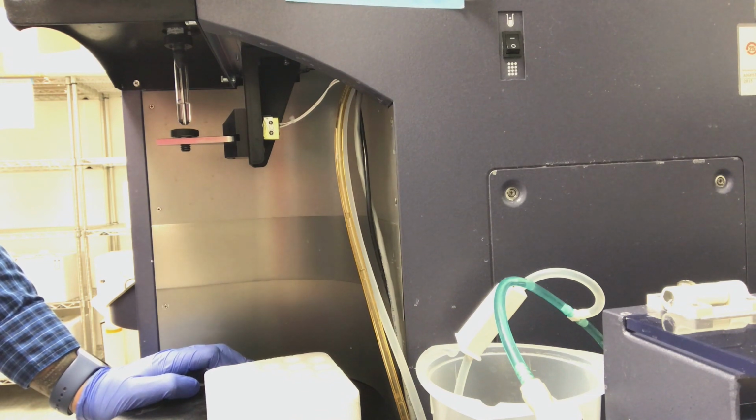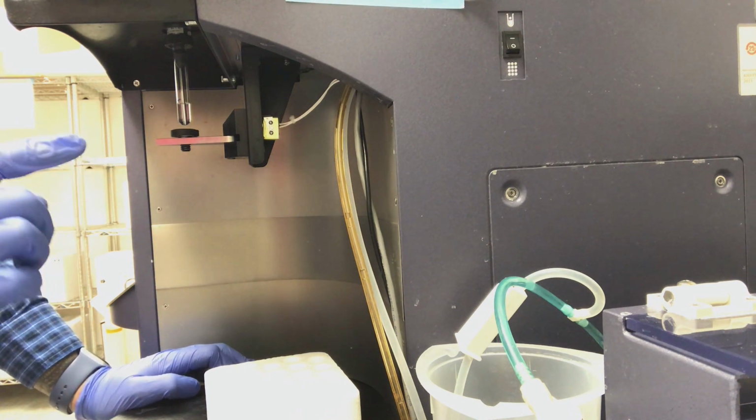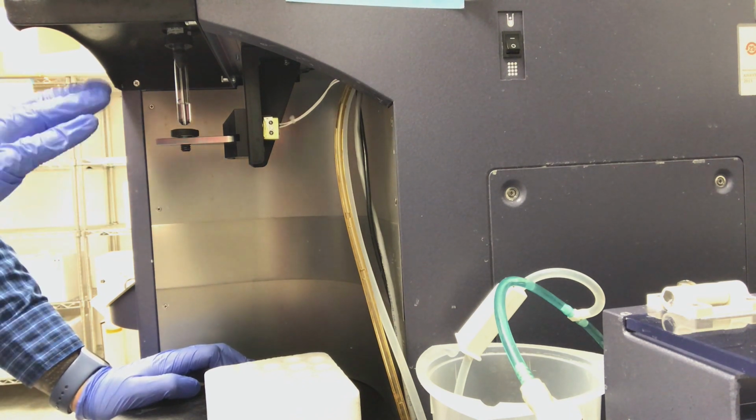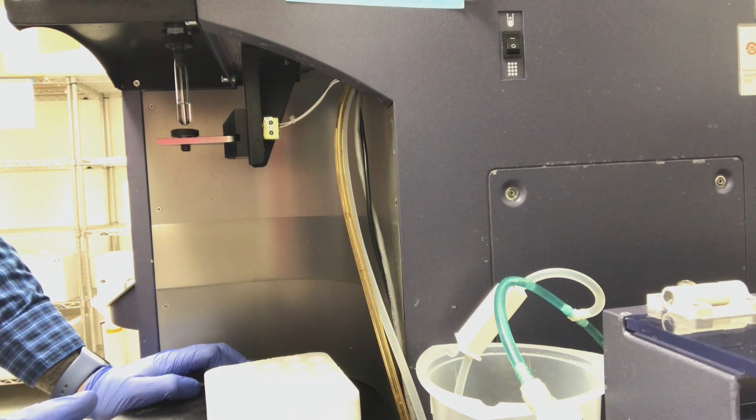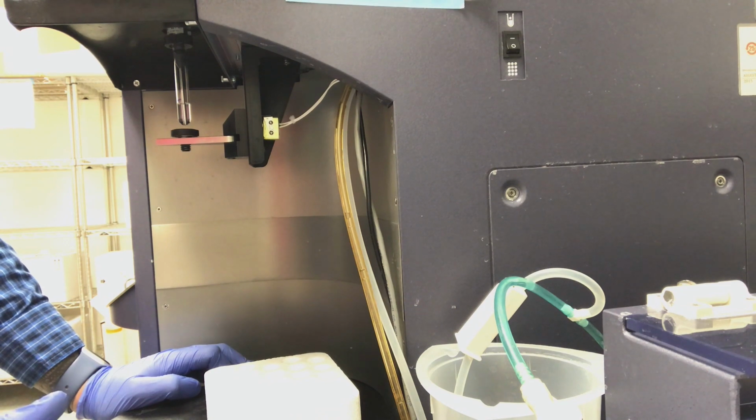On this machine, it's also important, because there is no backflushing in between samples, that your water level is just slightly above your bleach level to make sure it rinses off any residual bleach that may be contacted on the probe.